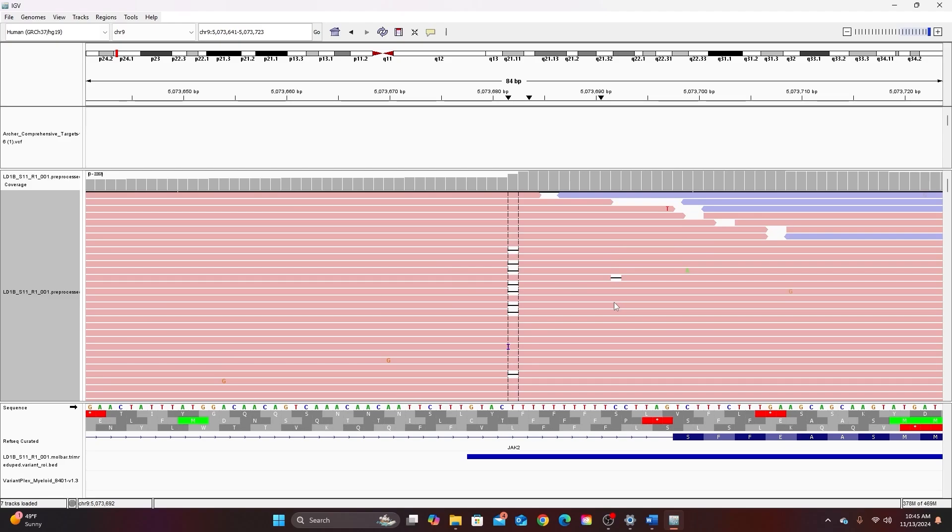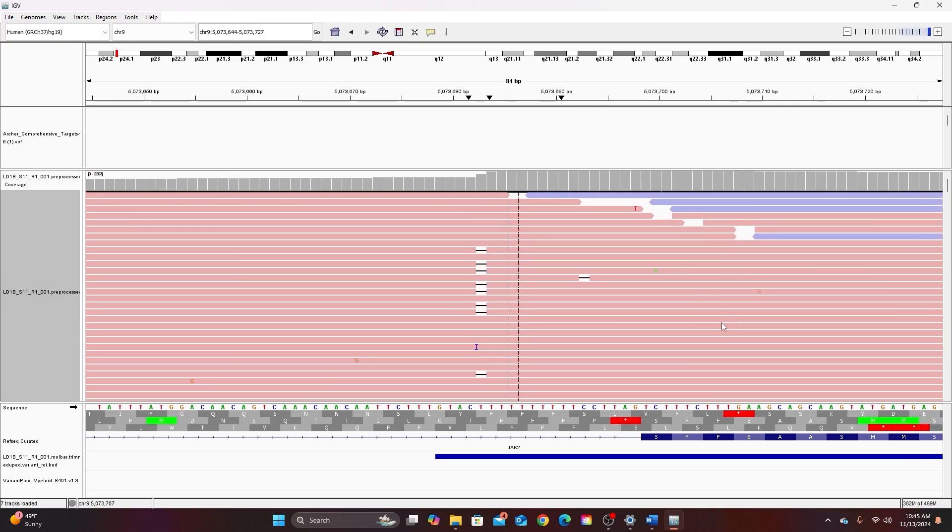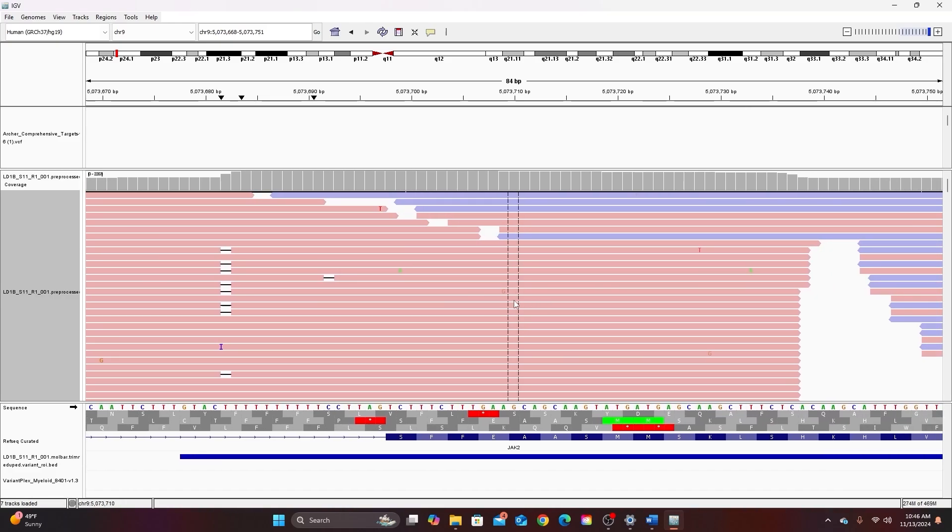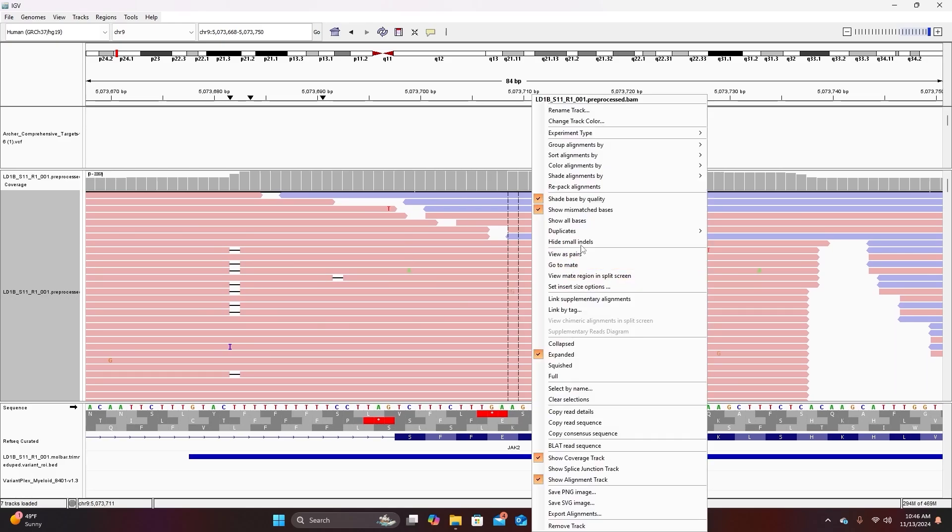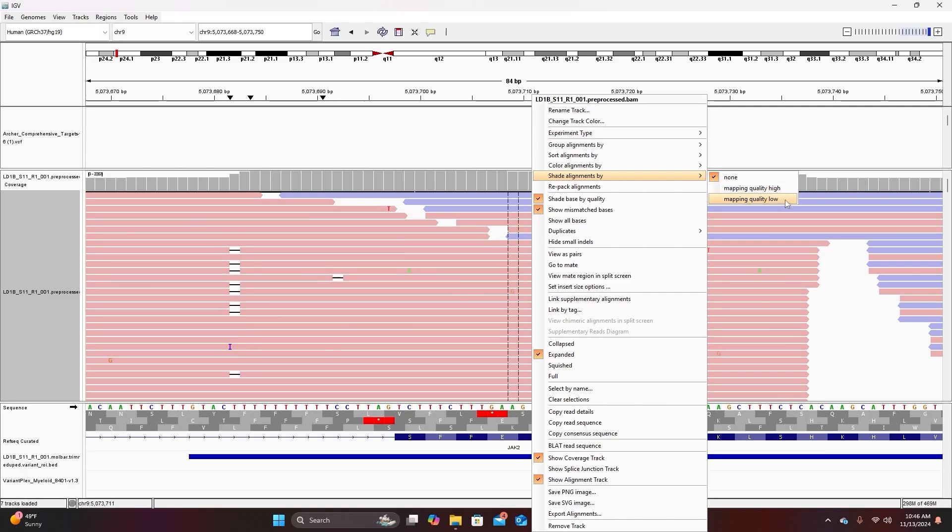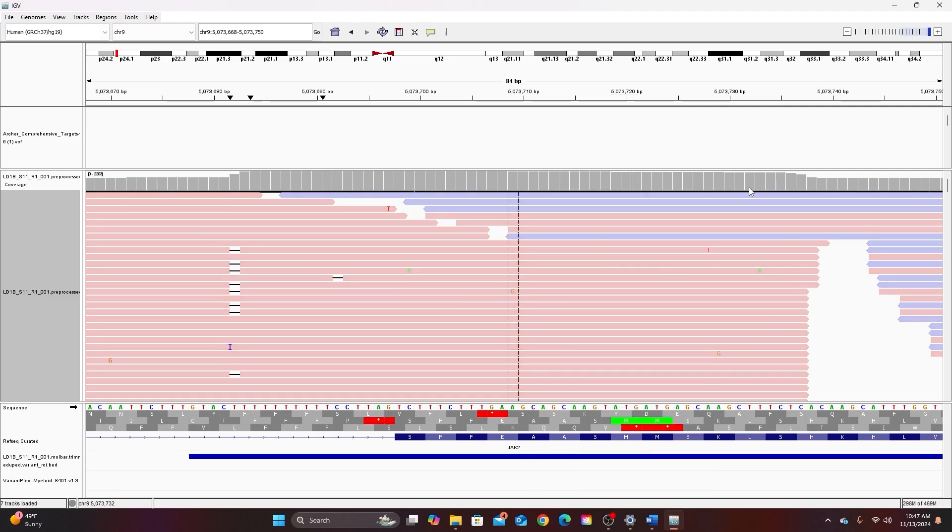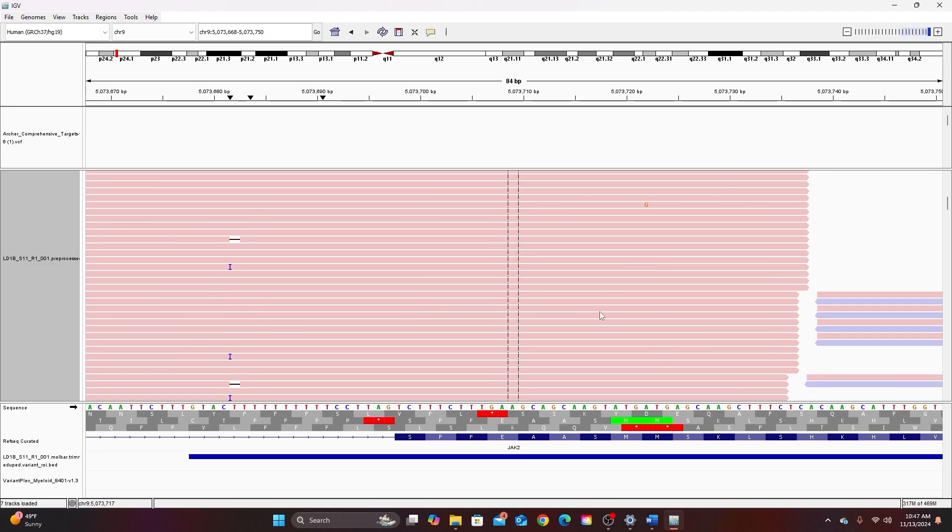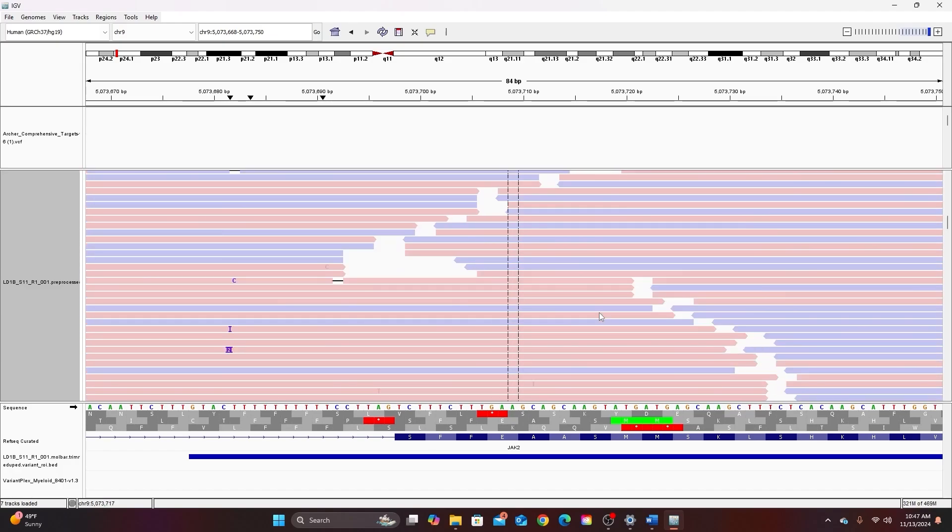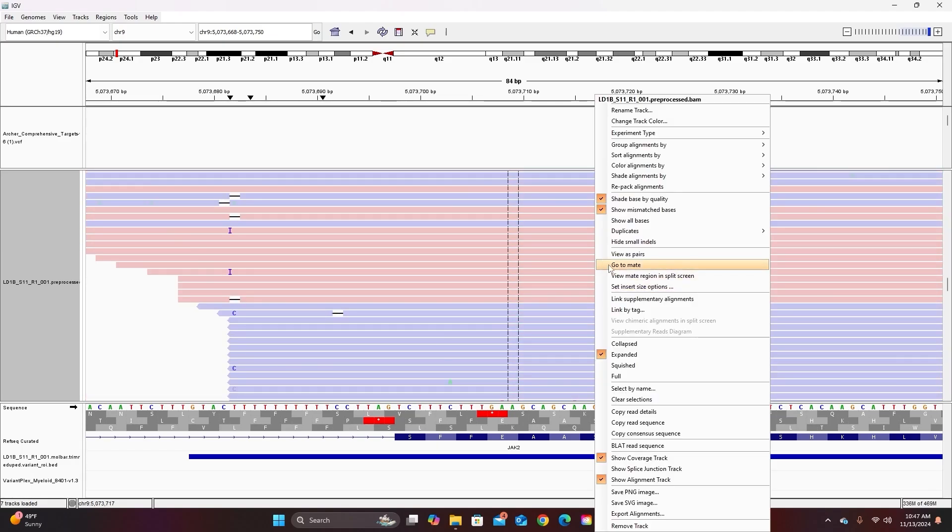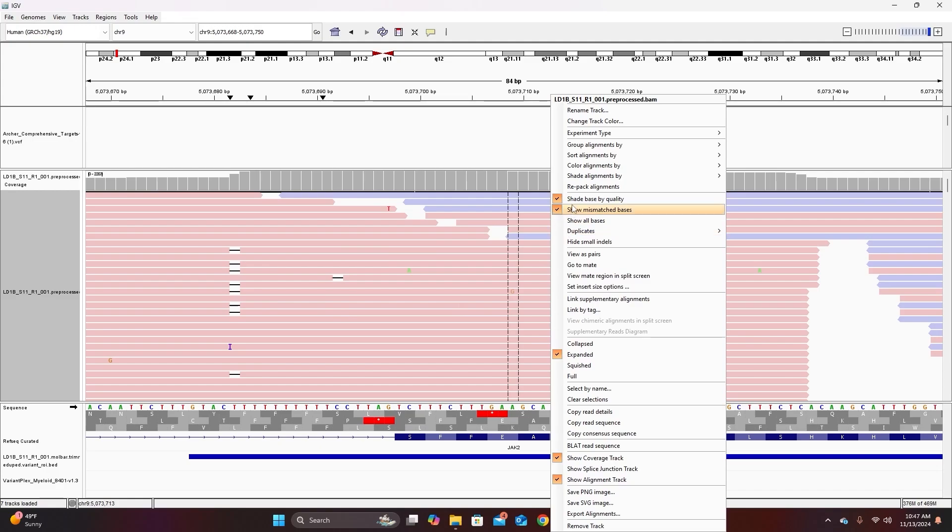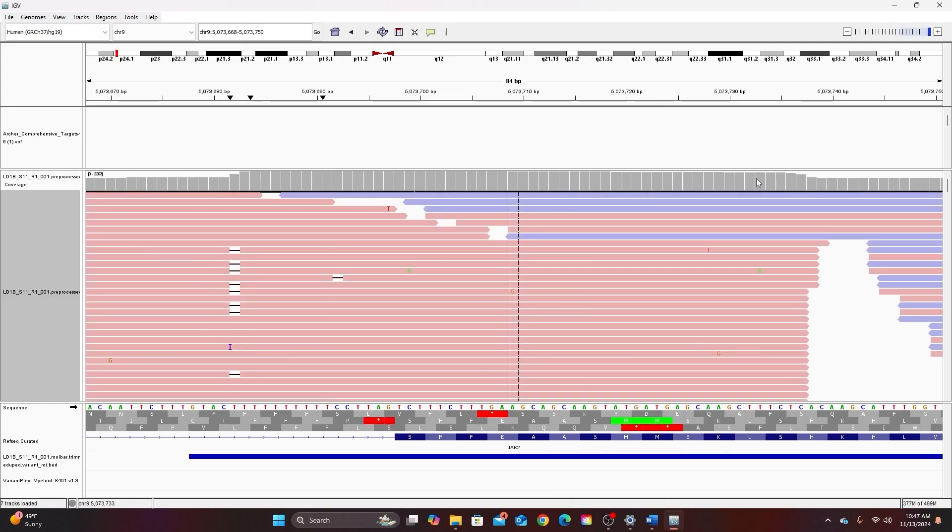So now all of the forward strands are pink and all of the reverse strands are blue. Now we already talked about shading bases by quality but I can also shade the alignments by quality scores. So here underneath color alignment options there are shade alignment options. So here you have mapping quality high and mapping quality low. So just like with the bases if I do mapping quality high the entire strand will be shaded by how well it maps to the reference genome. So darker is a higher mapping quality score. The alternative option just reverses that shading scheme. For now I just want to see these all shaded the same way so I'm going to go back to none.